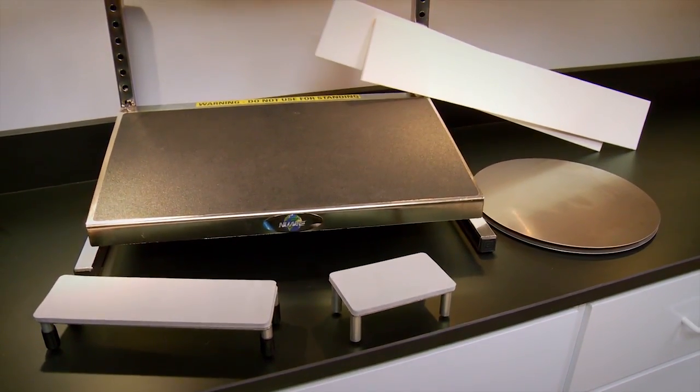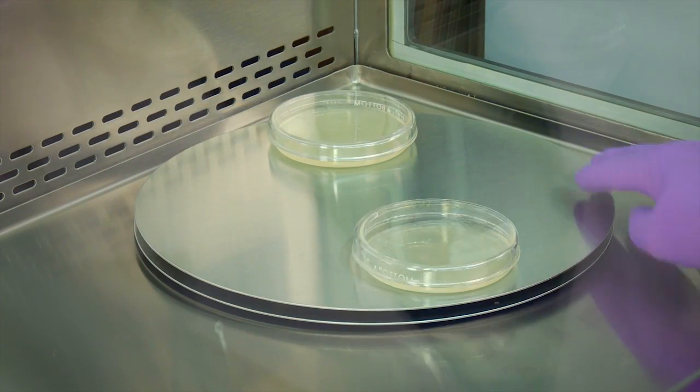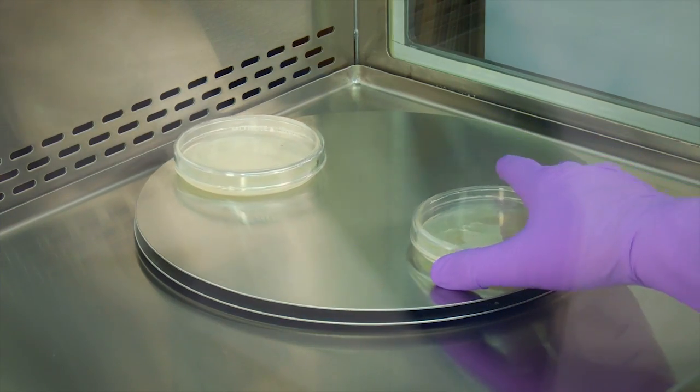Ergonomic accessories add to the ergonomic work zone. A stainless steel turntable extends the reach of users up to 12 inches into the back corners of the work zone.